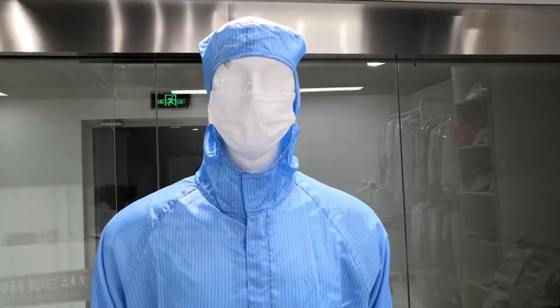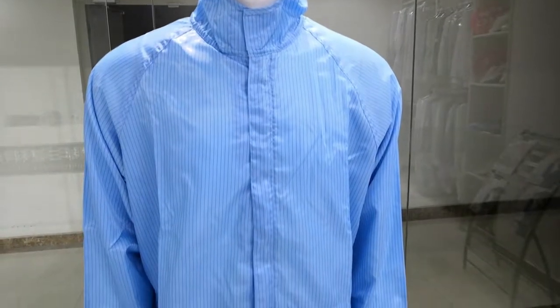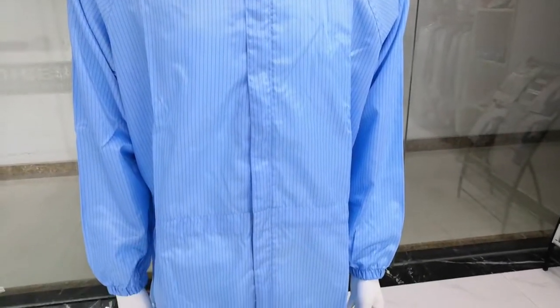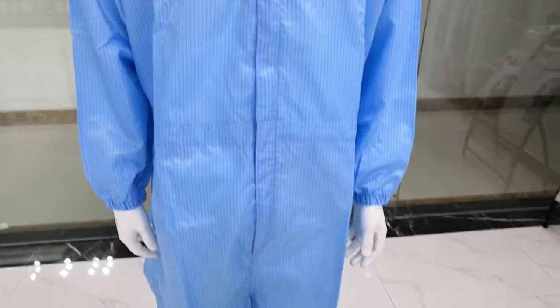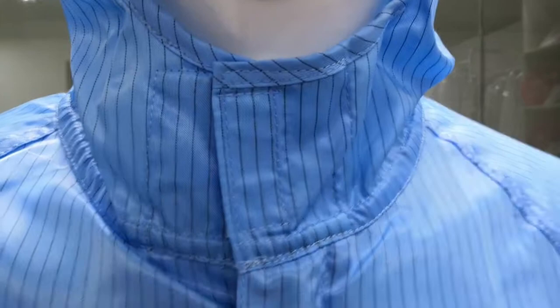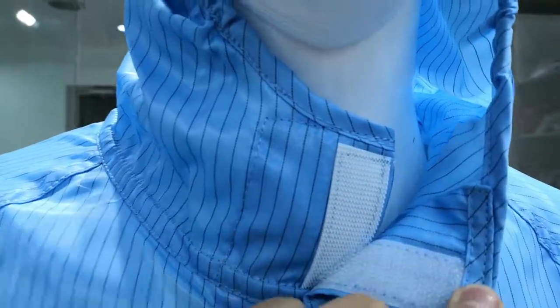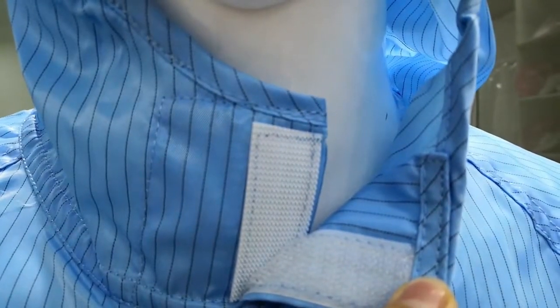Hi, this is our cleaner uniform. This part can be buttoned or like this. You can see our quality — it's very durable.